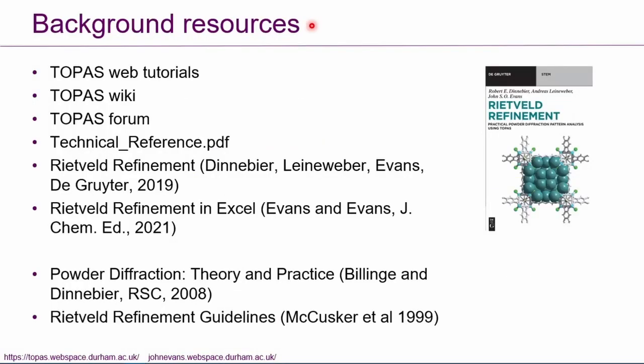If you want more information about any of the things we've talked about in this video, you might find some of these resources useful. At the bottom are a couple of general resources on powder diffraction and Rietveld refinement, and at the top are some more TOPAS specific resources. You might find the TOPAS web tutorials useful, which are on my web pages. The link is at the bottom of the slide here, but if you just do a Google for TOPAS tutorials Durham, you should hit that site. There's also a link to the TOPAS wiki, which contains lots of information about TOPAS and how it works.